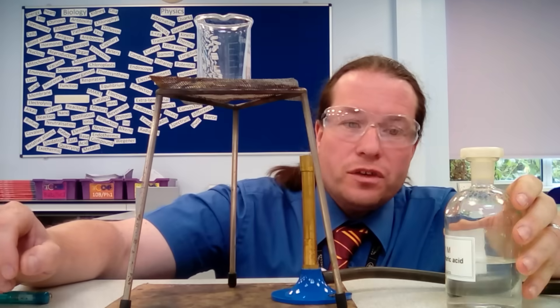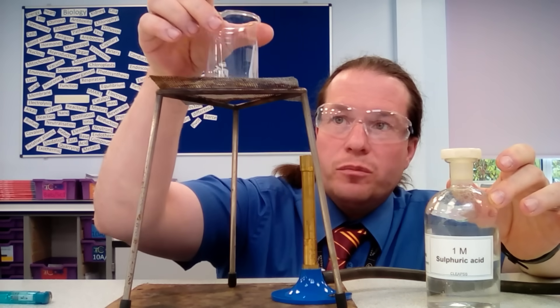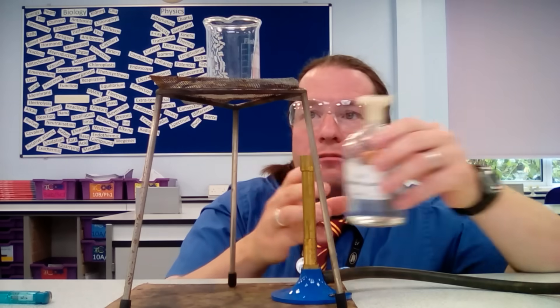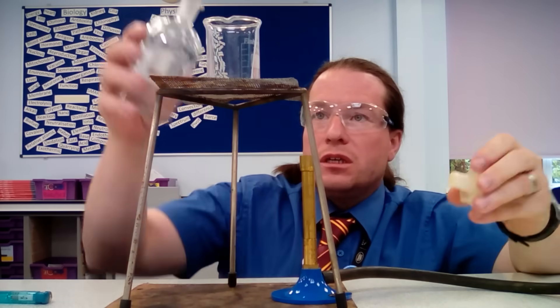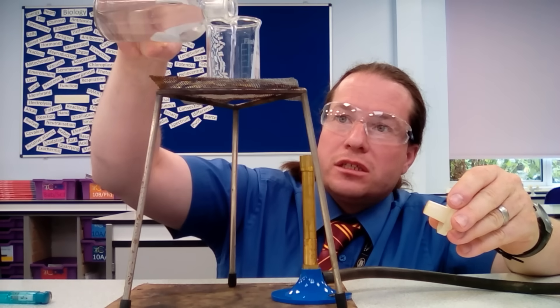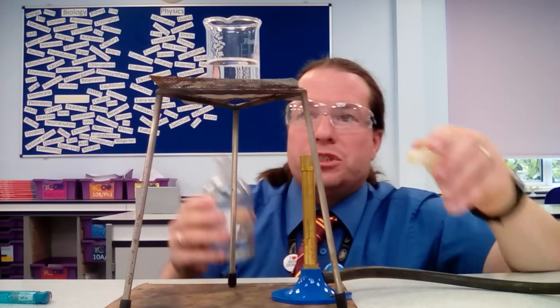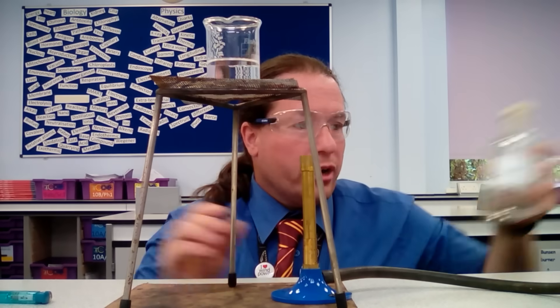The first thing we do is measure the sulfuric acid into the beaker. We want about 40 ml — it's not that accurate, so we don't need to use a measuring cylinder. We just use the gradations on our beaker.